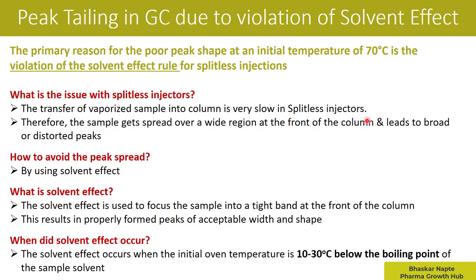The solvent effect occurs when the initial oven temperature is 10 to 30 degrees Celsius below the boiling point of the sample solvent. So you need to keep the initial column temperature around 10 to 30 degrees Celsius below the boiling point of the solvent used for preparation of the sample.